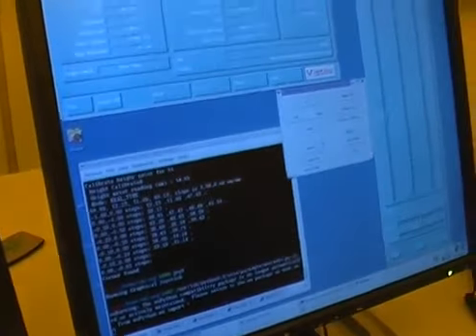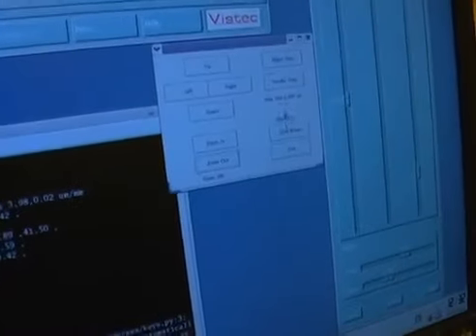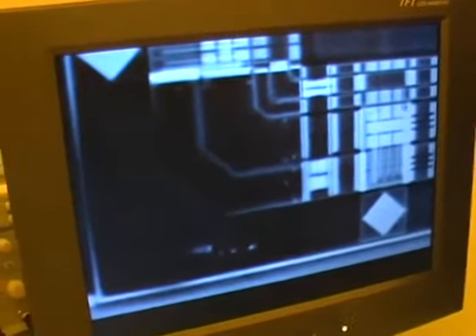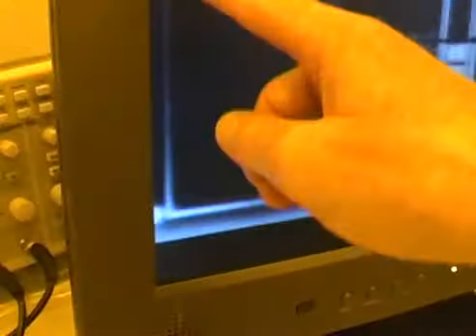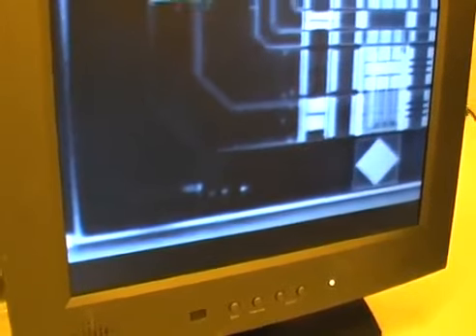Which is here. I can zoom out to the lowest magnification, switch on the SEM, switch it off again. You see we're not quite at the corner. There's the bottom of the sample, and I think that's the left of the sample, so I need to move a little bit. I'm going to do that in a second.